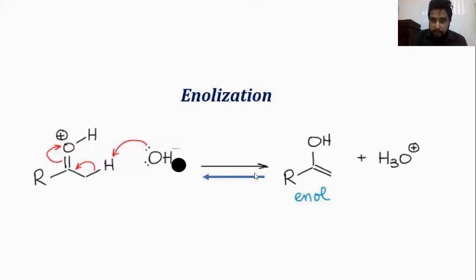Therefore, when we add sodium hydroxide, it will form enolic substances which are yellow in color. And when we add concentrated acid, that process will be reversed. That is why when we add concentrated sulfuric acid, the yellow color disappeared. Okay, so this is the principle.